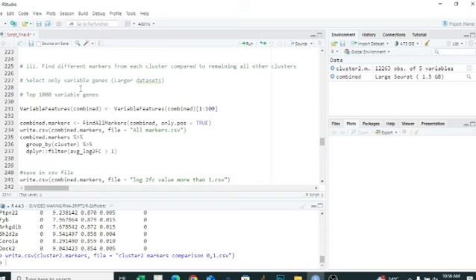So if you have a large data set, you can use this approach, even when your laptop is not working well. I select 100, even though I could select 50, because it takes less time. Just for demonstration, I think it is enough.